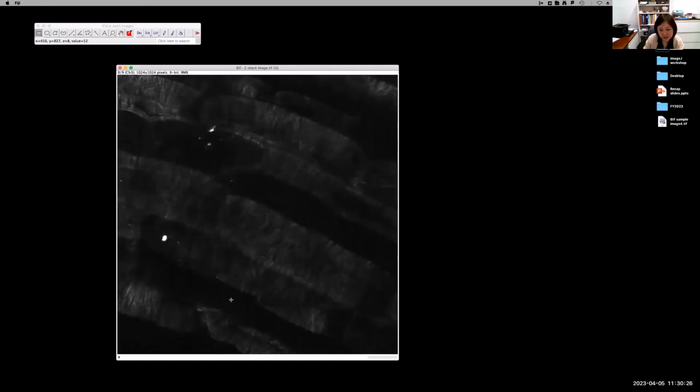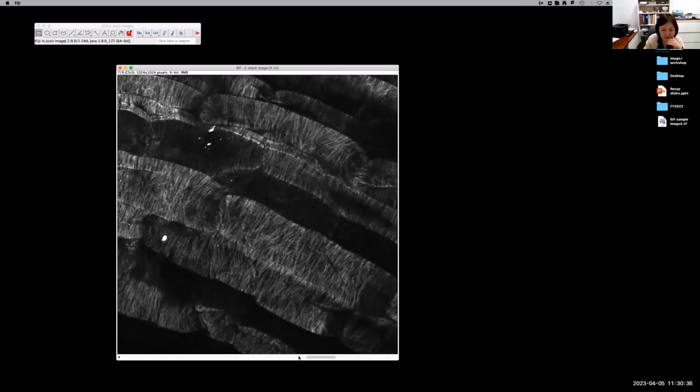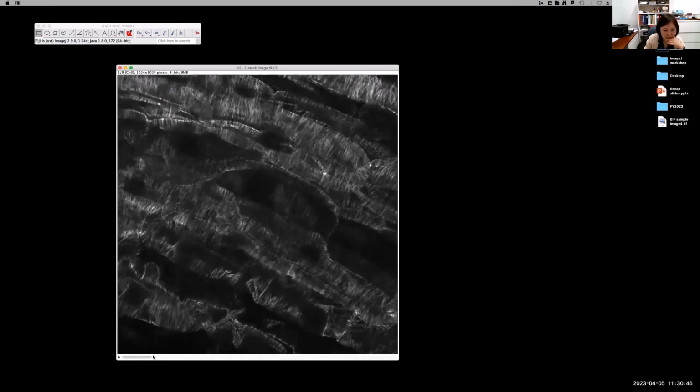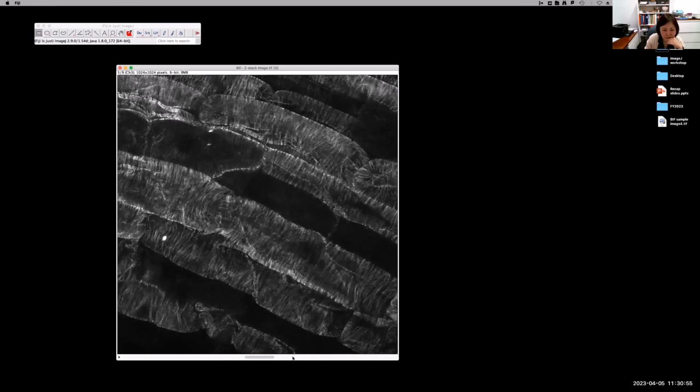Slice 9 is kind of getting out of focus. And I'm looking at those lower middle 2 cells. Those ones have nice microtubule labeling. But the microtubule labeling is not showing, for example, in image slices 3, 2, 1. Also, at 4, it starts to show up.